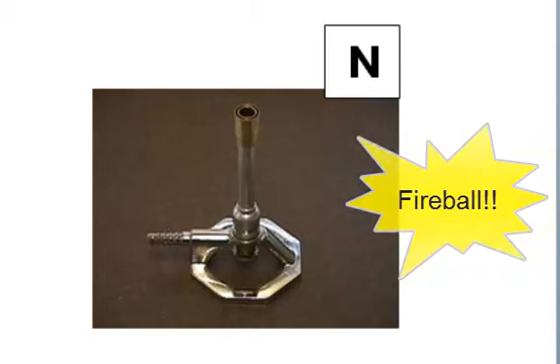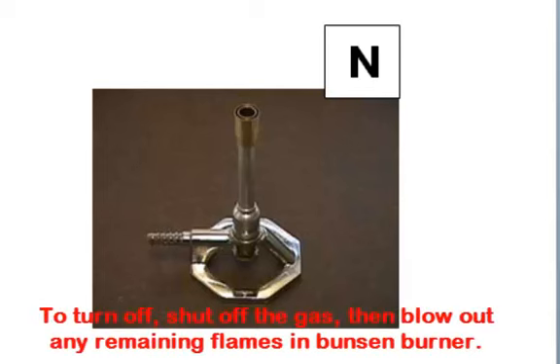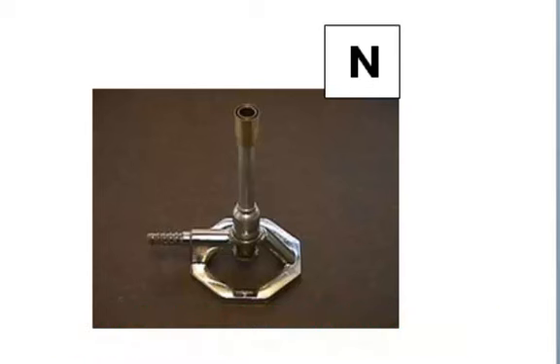The rule is light the match, then turn on the gas. To turn it off, you want to turn off the gas and then give it a little blow. That just ensures that any remaining flames are out. We're gonna be working with Bunsen burners with two people. One person's gonna be operating the gas nozzle that I'll show you in class. The other one is gonna be lighting the match. So your goal is to light it with one match by January.